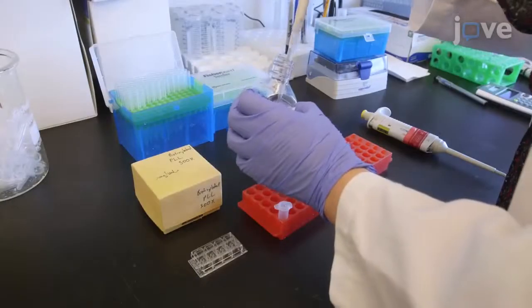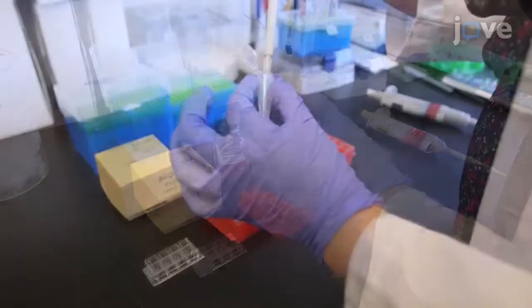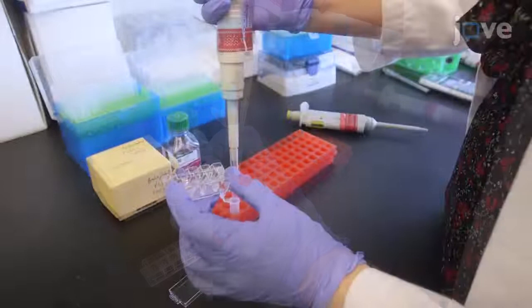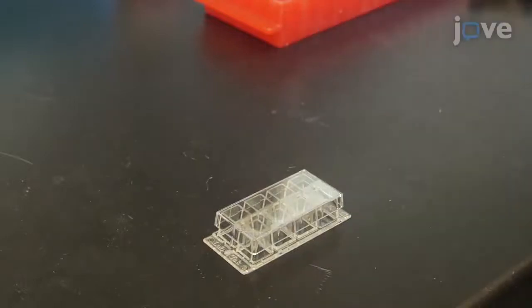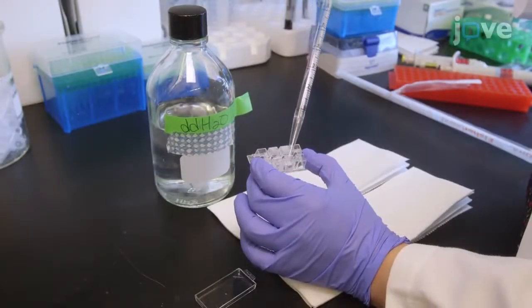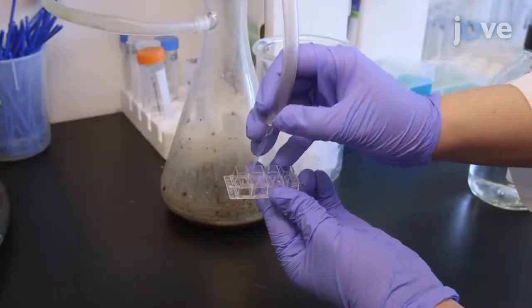Begin by adding biotinylated poly-L-lysine, or bio-PLL, diluted 1:500 in distilled deionized water to 8 well-chambered cover glass. Incubate for 30 minutes at room temperature. Following the incubation, wash with distilled deionized water and then dry for 2 hours at room temperature.